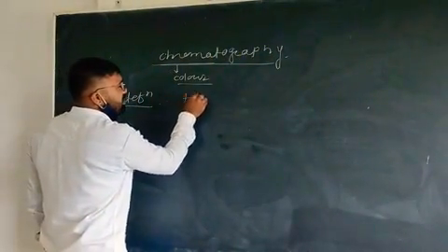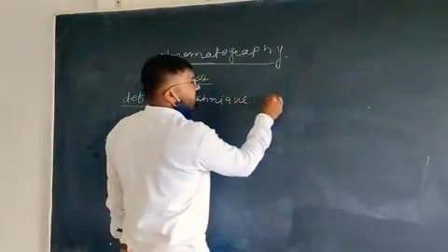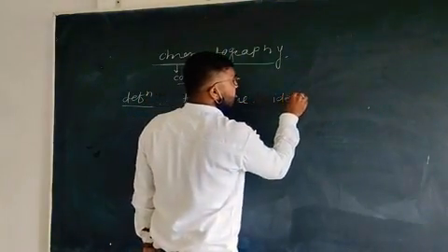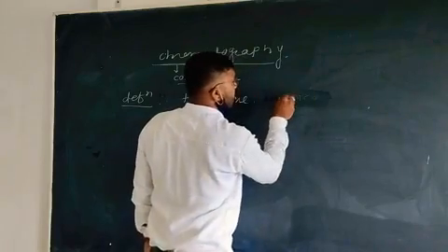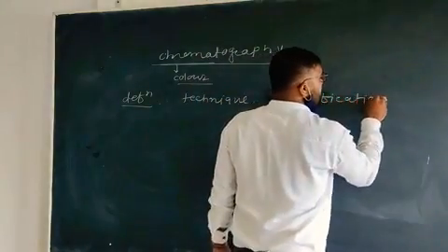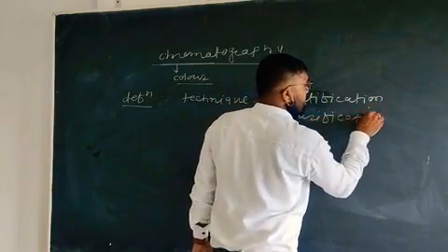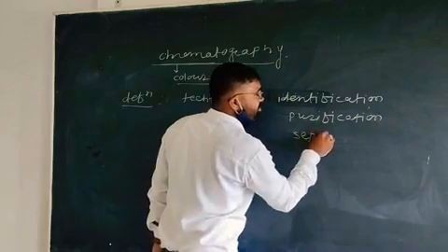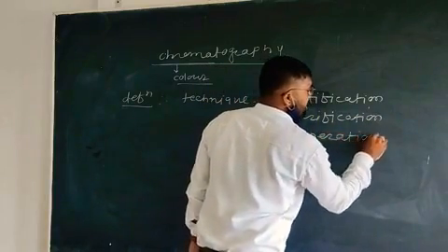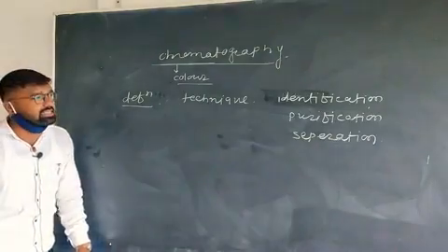It is a technique which is related with identification, purification and separation purpose.